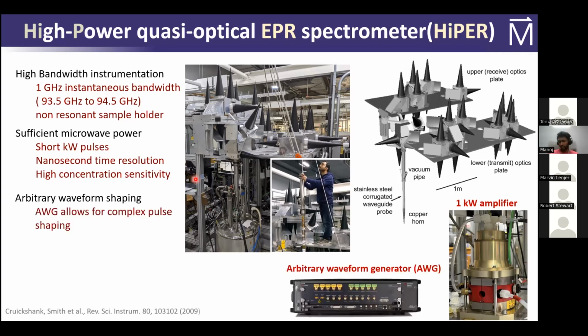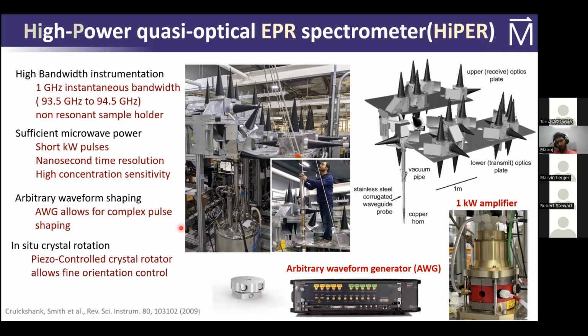In addition to that, we also have an arbitrary waveform generator that provides us with complex waveform shaping. And recently we have installed a piezo-controlled crystal rotator that helps with single crystal rotation studies. So this recent upgrade is not relevant to the current talk, but this is something new and exciting I wanted to mention.